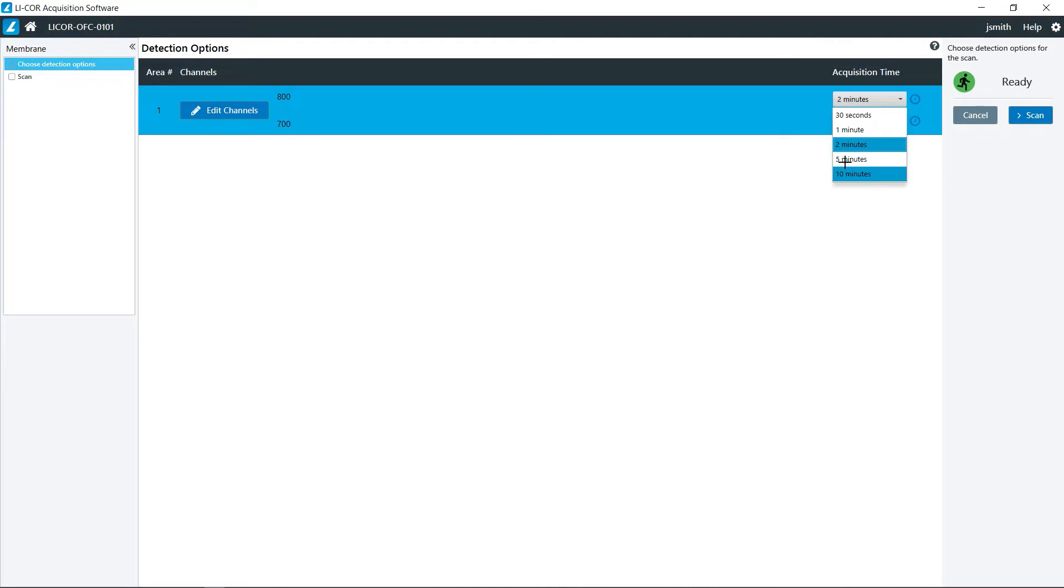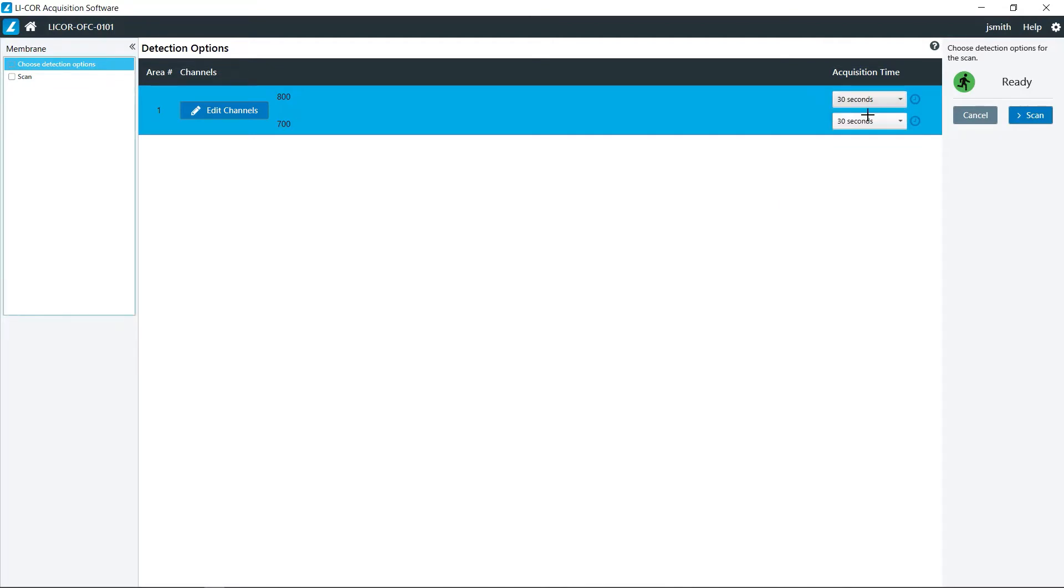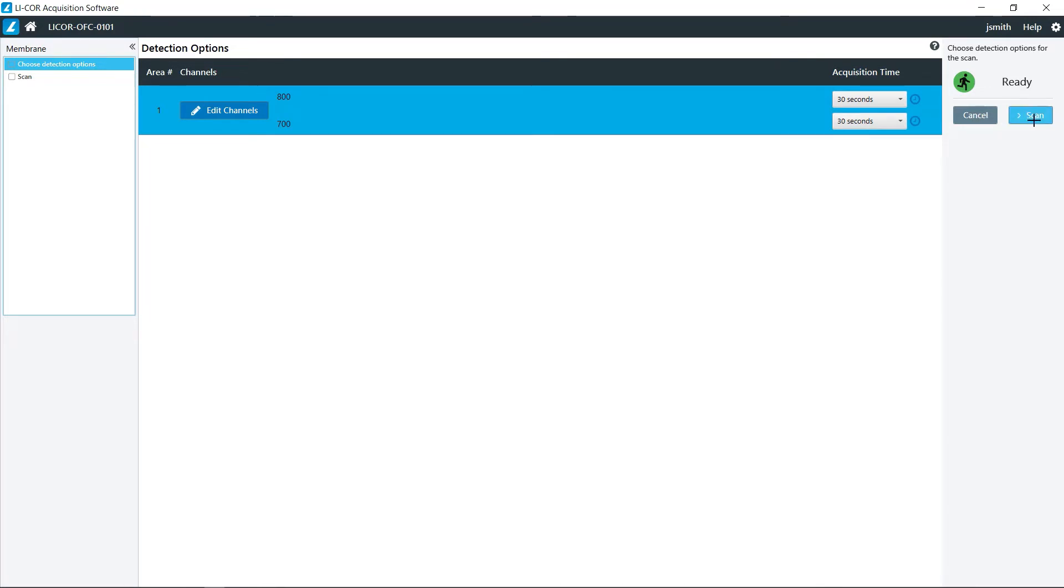Just for the sake of time, I'm going to set these both for 30 seconds, and then click scan.